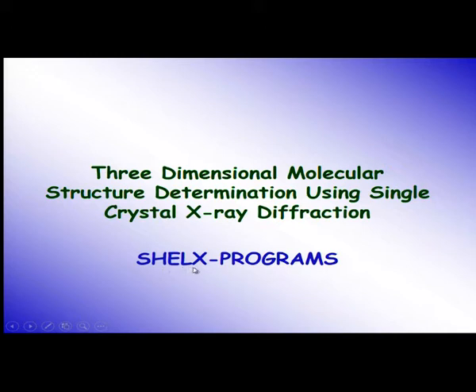SHELX has two programs. One is called SHELXS. S means structure determination. Another is known as SHELXL. L means least squares refinement. So, we are going to see in detail both the programs.